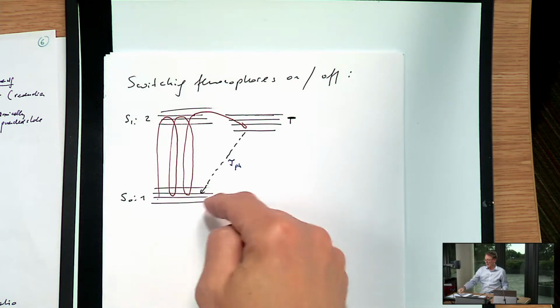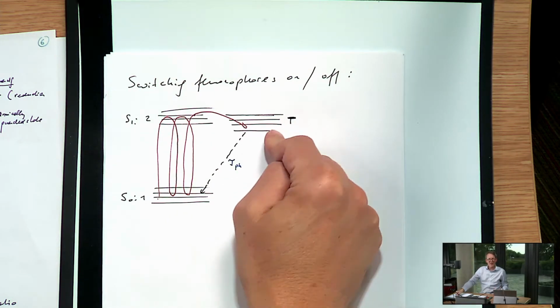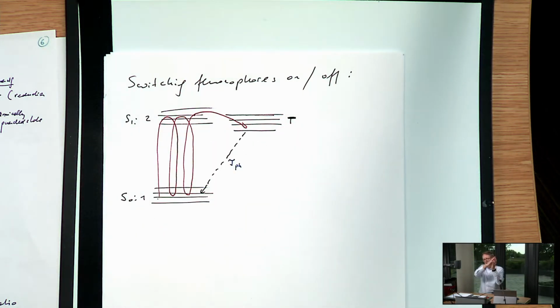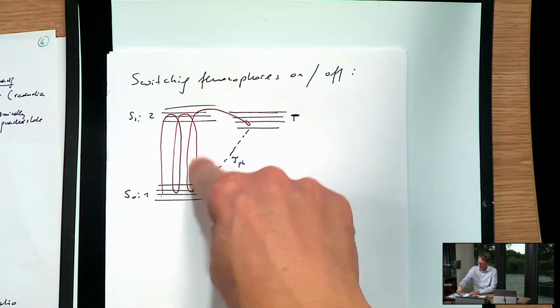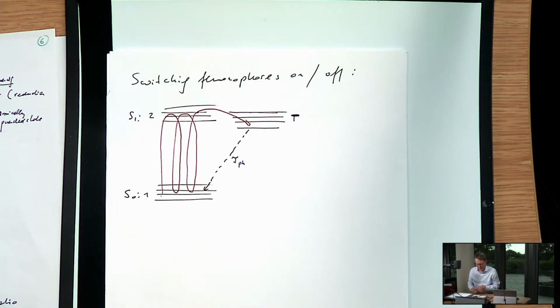And so something that you excite into this triplet state will glow forever after you've excited it. And of course, the old watch dials exploited this process. Normally in fluorescence, we don't have to deal with this, right? But if you just cycle this a long enough time, most of the molecules will end up in this triplet state, and then the system becomes dark.